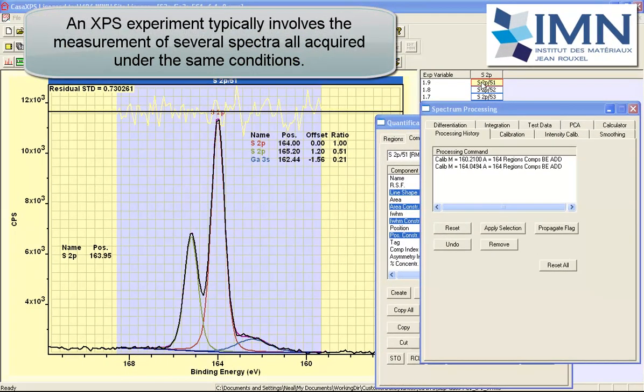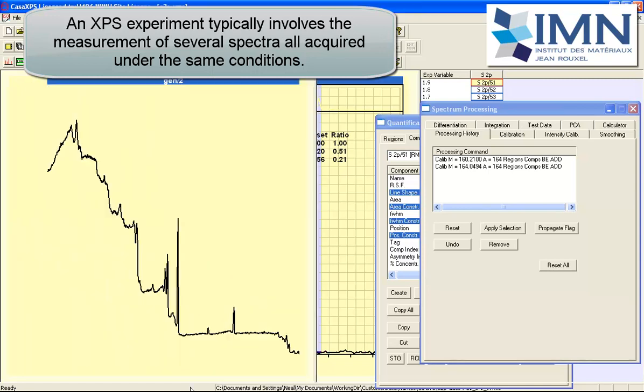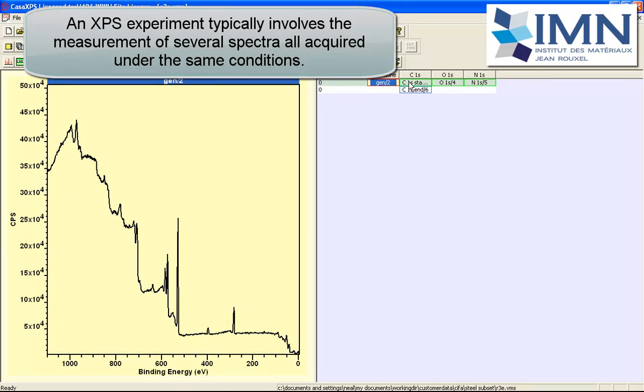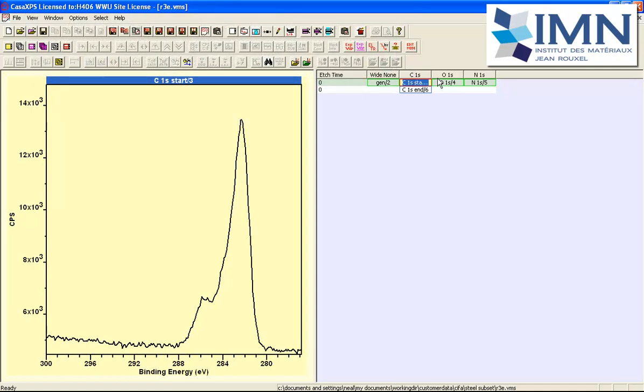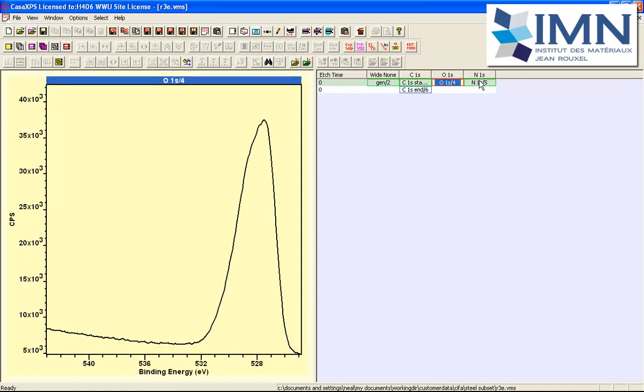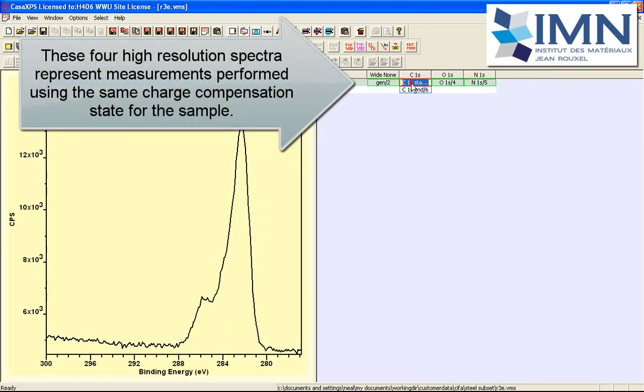These measurements were performed to illustrate that a charge compensation state can alter the position for a peak. More typically a measurement is performed using similar charge compensation states. However the material itself can cause a different response and therefore peaks shift in slightly different ways depending on the material. However when we have charge compensation active we presume that each one of these high resolution spectra that were measured sequentially will have the same compensation state so we should shift them by the same amount.